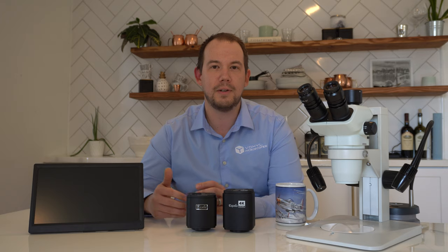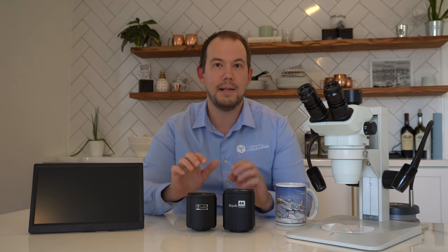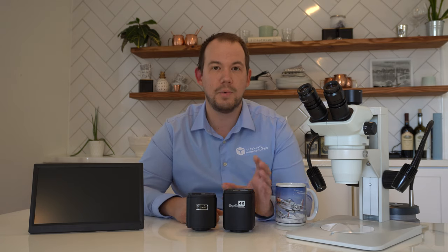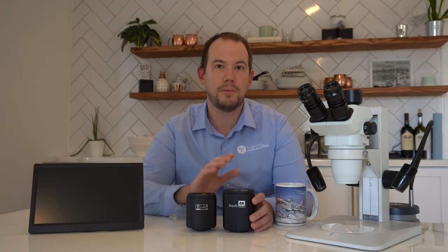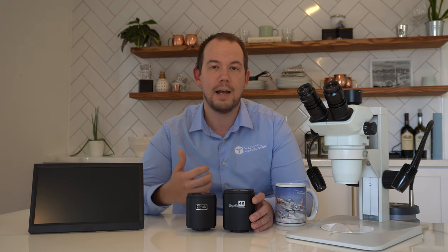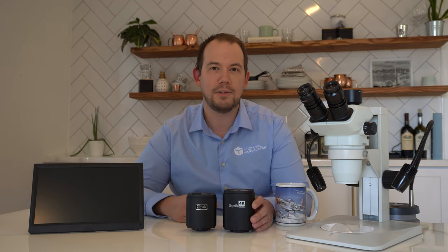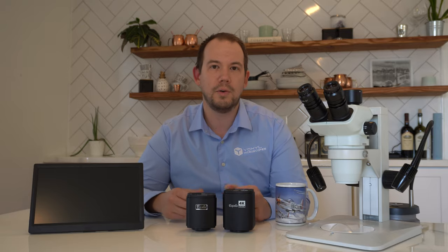It has all the features of the original HD camera in 4K resolution. Outside of the obvious difference in resolution between 1080p and 4K, there are a few other differences with the new Excellus camera. With the new 4K camera, you do have HDMI output — 4K at 30 frames per second to a retina display or monitor of your choice. There is also a USB 3 interface with upgraded software that includes live tiling and live extended depth of field. AccuScope has also included an Ethernet connection so you can stream your live images within a local network.